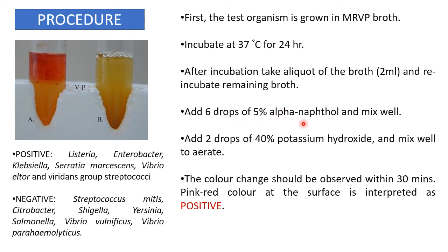Add 6 drops of alpha-naphthol and mix well, aerating the broth so the alpha-naphthol reacts well with the acetoin. Then add 2 drops of 40% potassium hydroxide, which converts the acetoin to diacetyl. Diacetyl reacts with the alpha-naphthol to produce a color change. Observe within 30 minutes — a pink to red color at the surface indicates a positive result.